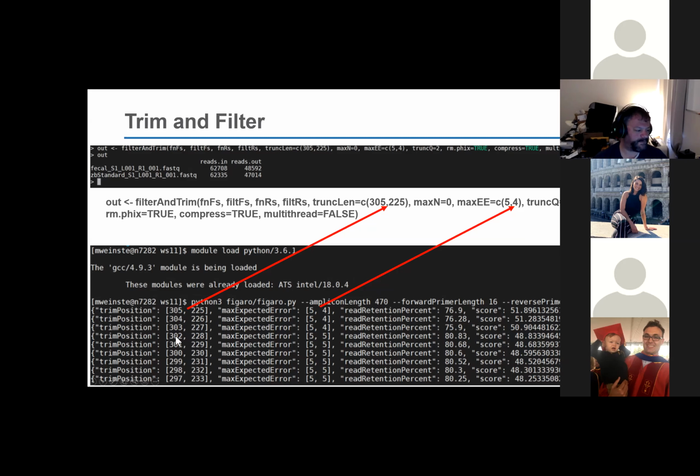Oh, I think I know where that came from. You know what we forgot to do, and I think that got cut off the top of this slide. I know exactly what we forgot to do. We went through installing DADA2 and we actually forgot to load it as a library. So I just sent out a command, try running that, and that should get everybody up and running.